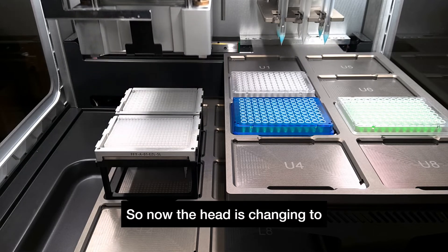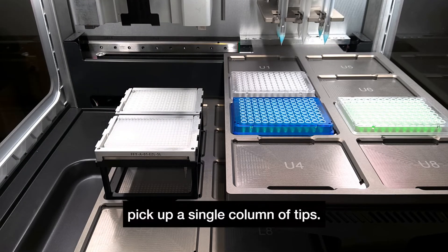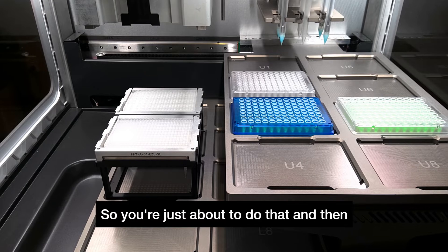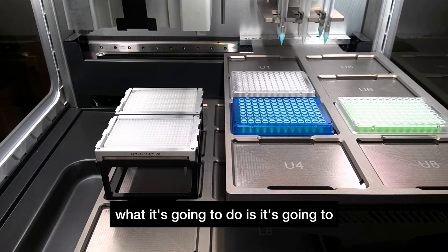Now the head is changing to pick up a single column of tips. It's just about to do that, and then it's going to go across.